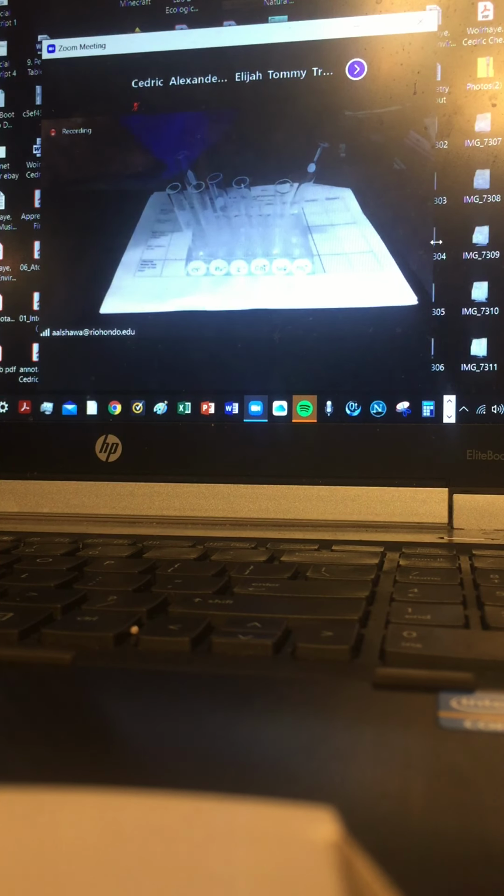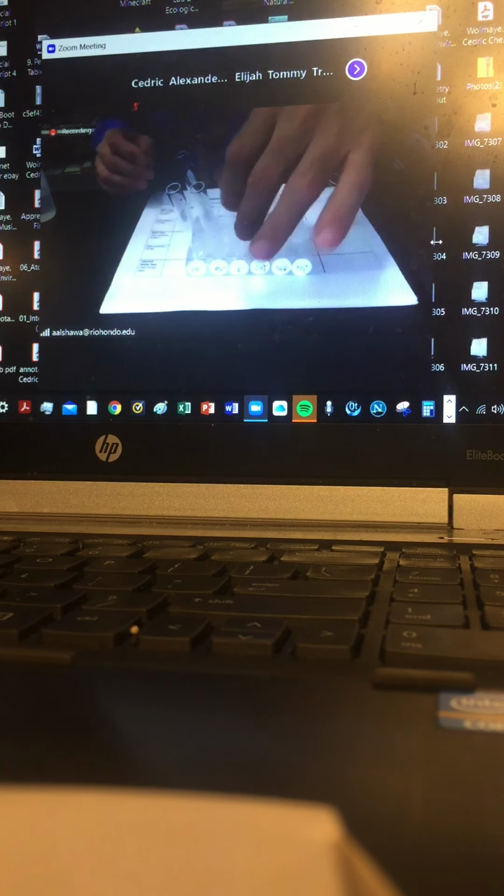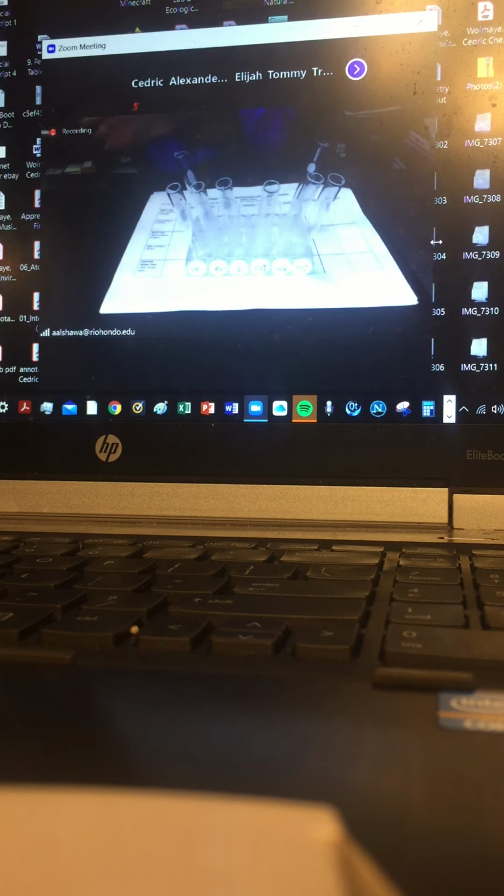Phosphate. With slight contamination, you end up with absolutely no result, and the result would not make sense any longer.